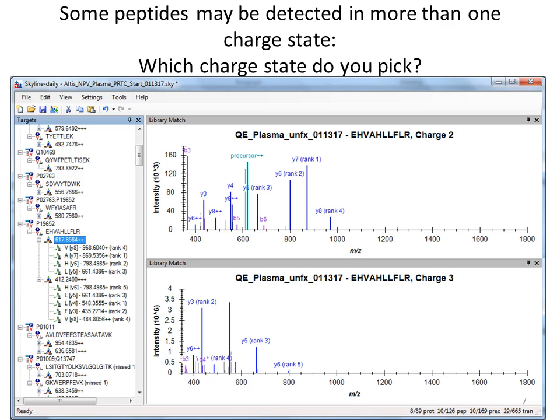Personally, I go through it because at the end of the day, I am not the person making any kind of decision from my data. It's going on to someone else to make a decision, and I want it to represent the best quality data that there is. And so I go through it manually. There are tools like that sorting that make it easier. And there may be people that have confidence in other ways to do it in a more streamlined, let the software take care of it approach. But I have not done that.